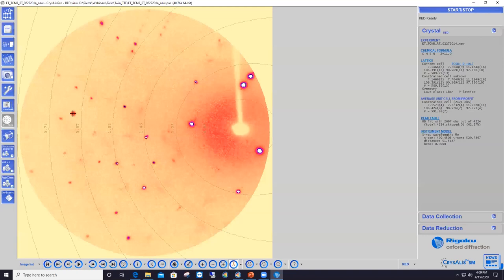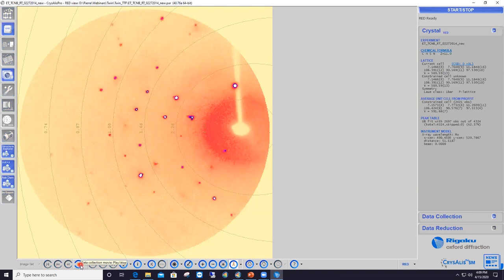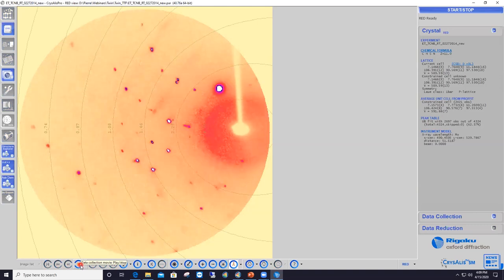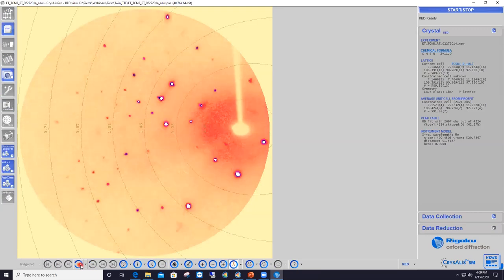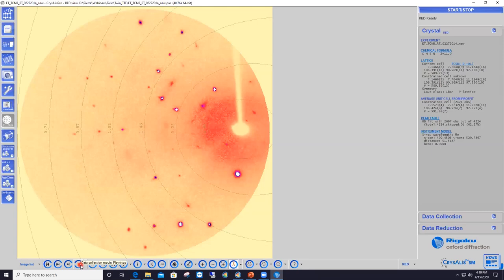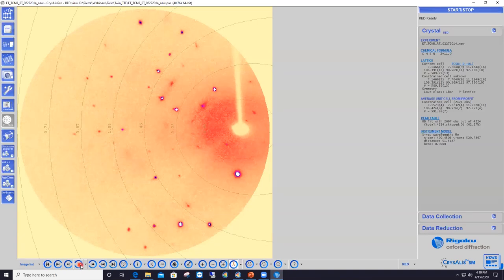Once the display is adjusted, I always like to play the dataset as a movie at once using this button at the bottom left. Just left-click and watch the whole dataset play — this lets you see within a few seconds whether data collection went well throughout, or whether something happened, such as the appearance of ice features, diffraction intensity going down indicating the crystal moved or suffered radiation damage. In this case, the dataset was fine throughout.